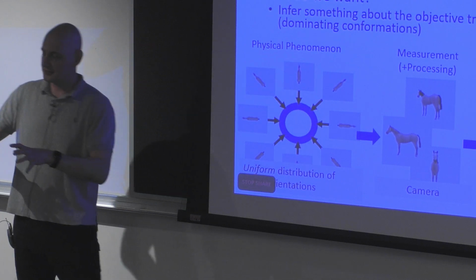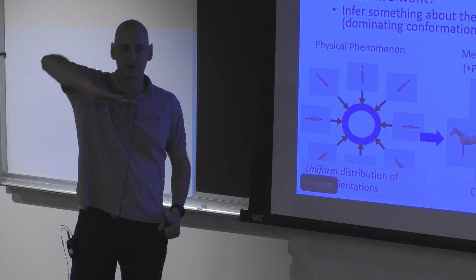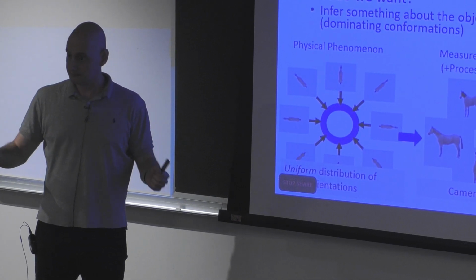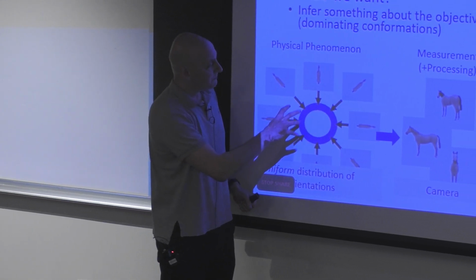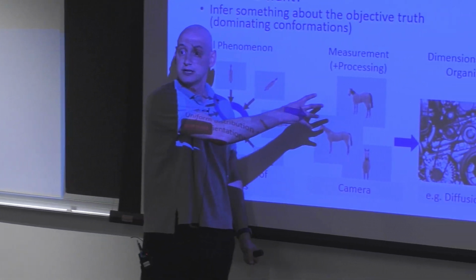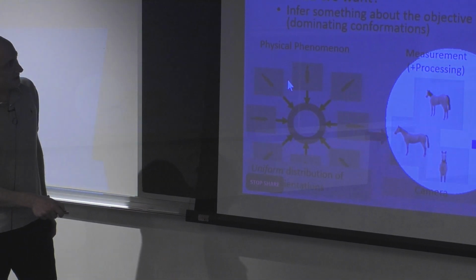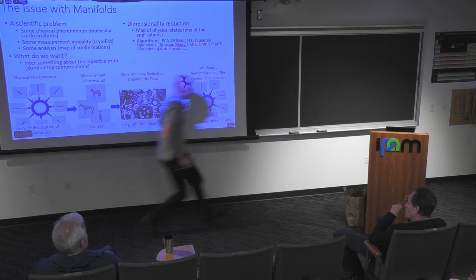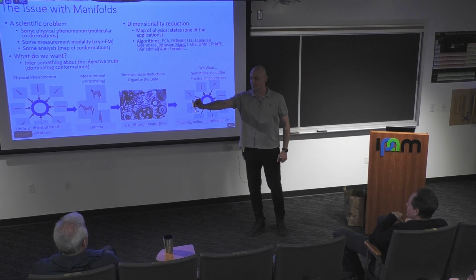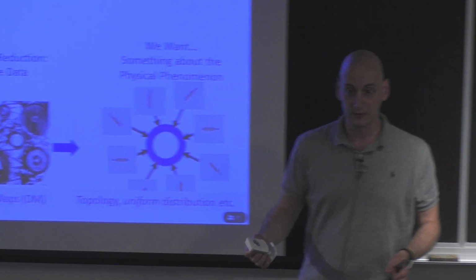What we do is we have this horse in different orientations. So that's these different directions that the horse takes. That's the different physical states, okay? We're sampling them uniformly. But we don't directly observe the viewing directions. What we observe is some kind of measurement. I'll explain this with this. So I have a camera, and the camera is taking images of the horse or of Wonder Woman, and that's our physical measurements.